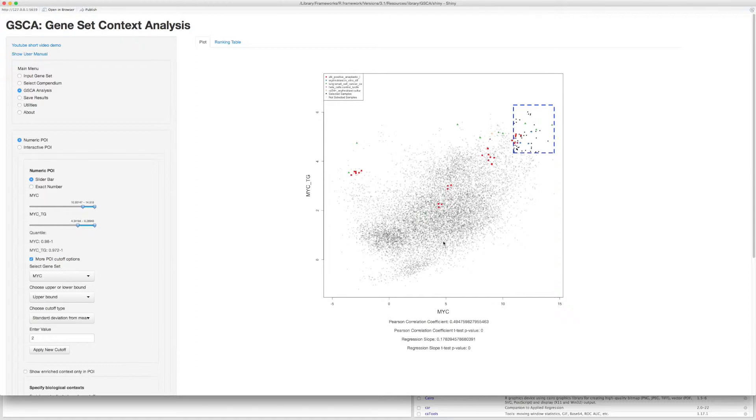For Numeric Pattern of Interest or POI, the POI in the scatter plot is the top-right region defined by the blue rectangle. Change the POI by sliding the bars here.